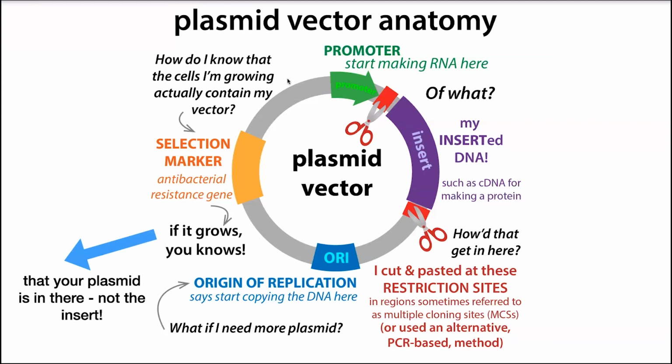An alternative method is whole plasmid sequencing, which is getting more affordable, and that'll basically allow you to sequence the entire plasmid. But we're going to focus today on the traditional sequencing. When we talk about sequencing, we're talking about Sanger sequencing, where we're basically going to design primers that are going to sequence this insert. And I'll tell you more about how we do this.